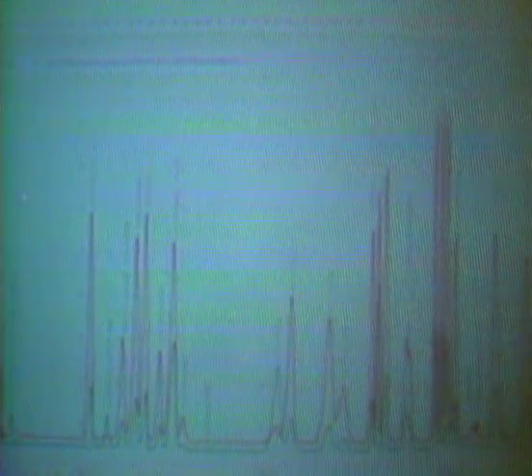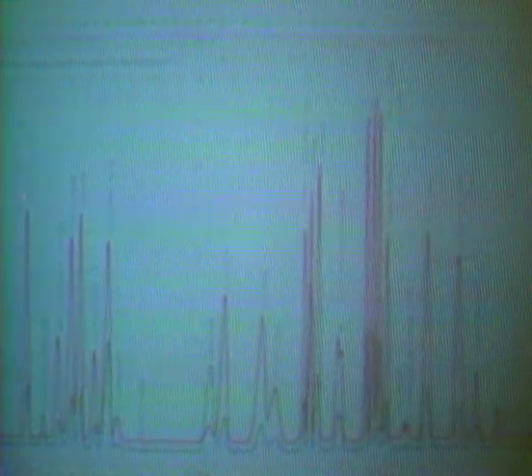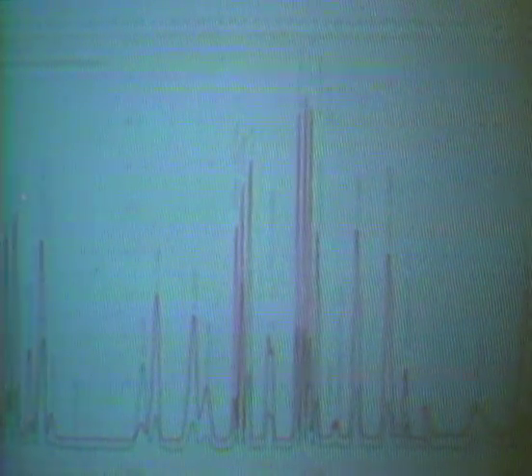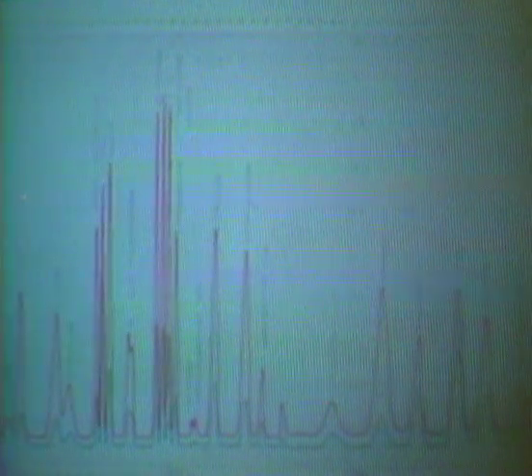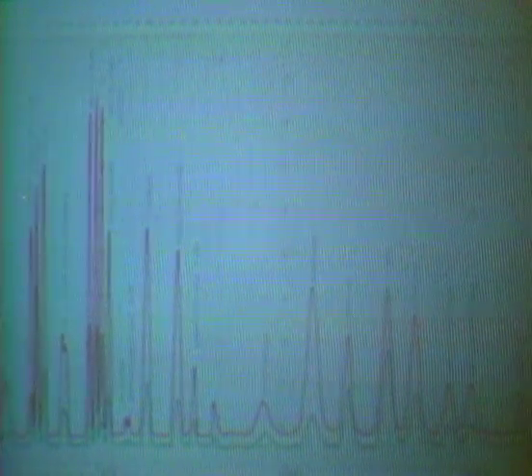One of the most impressive applications of ion exchange chromatography was the separation of more than 50 amino acids in the classical work by Moore and Stein. Temperature and pH were varied in accomplishing this achievement.